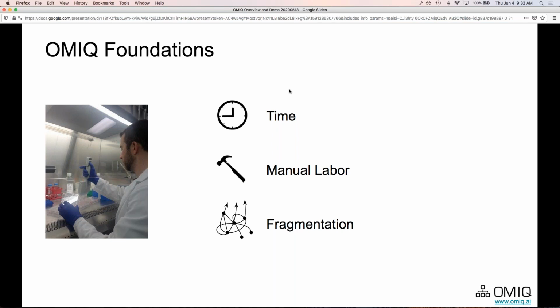It also made it such that when I invariably messed something up at one of the early stages and realized it at the later stages, I had to go back and redo my movements between 3 or 4 different softwares. So this is very painful. Fragmentation was also hard to get in front of other colleagues and collaborators, right? Just to have them look at the data.